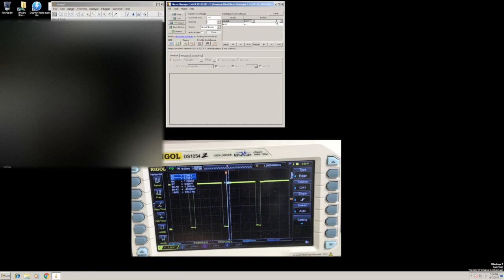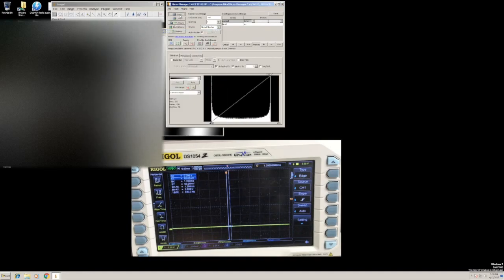But anyway, this should support any customers that want to use the Triggerscope to drive an LED driver, for instance, with PWM. You, of course, can set this up for opening and closing, which is going to turn on and off at a particular PWM duty cycle. And then if you auto shutter this, I've got it set up for about 100 millisecond exposure. You can say snap, and you'll get your PWM cycles turning on only for the exposure time.